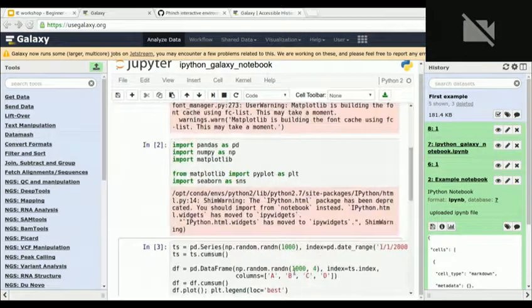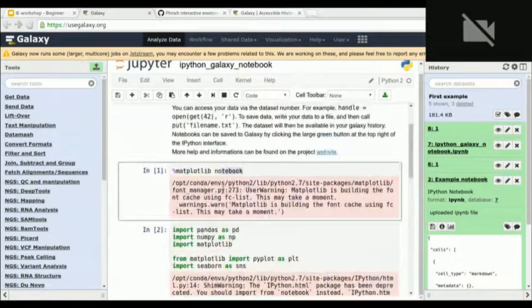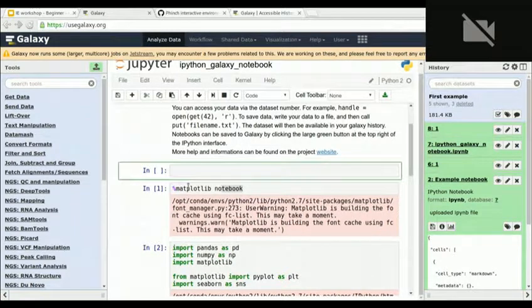But if you want to change it, if you are familiar with programming, you can just change some variables, annotations, whatever. If you want to do it more flexibly, for example, if you don't want your user to change some parameters here, again, just create some annotations at the top of your notebook, for example, and you can just say here are some variables.